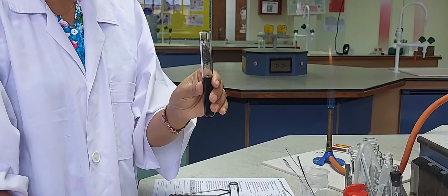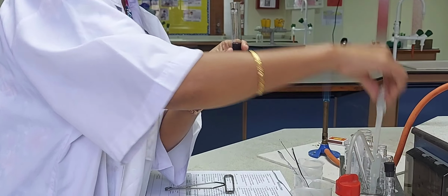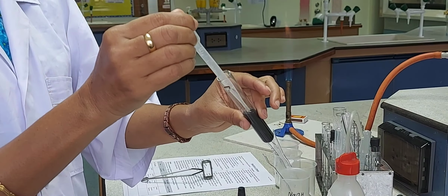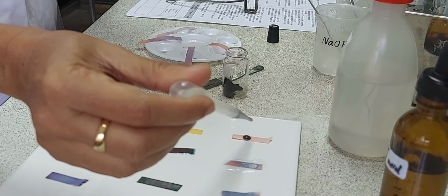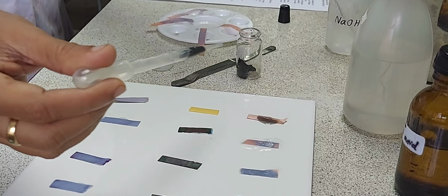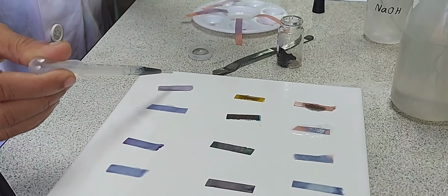So I will take a few drops of copper oxide that is being formed to test for its alkalinity. So add it to the red litmus paper, add it to the pH paper, and a few drops to the blue litmus paper.